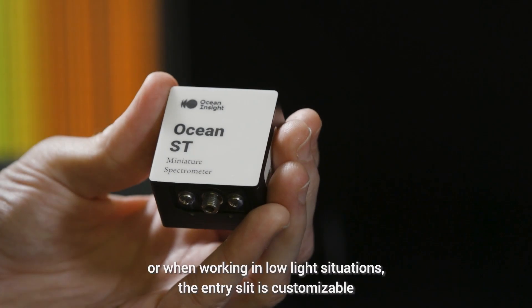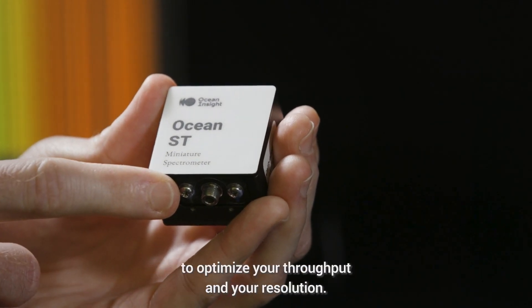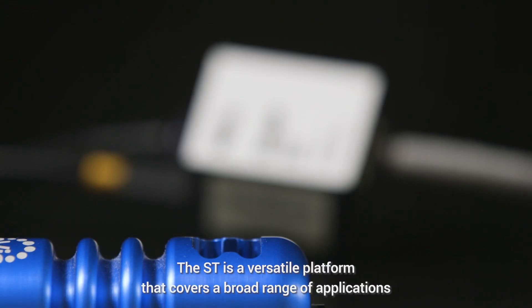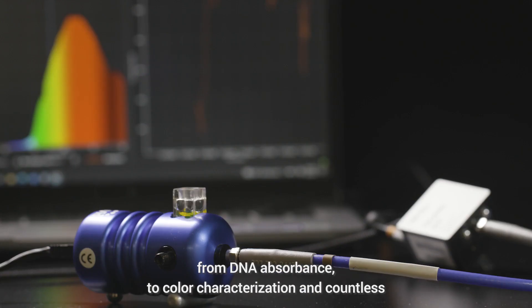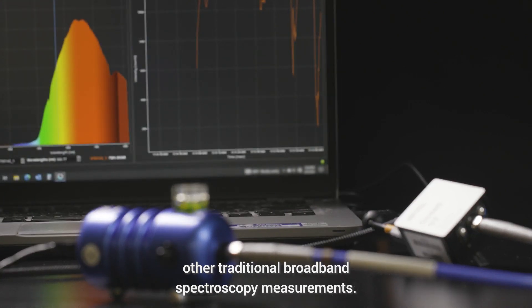For high-quality data or when working in low-light situations, the entry slit is customizable to optimize your throughput and resolution. The ST is a versatile platform that covers a broad range of applications, from DNA absorbance to color characterization and countless other traditional broadband spectroscopy measurements.